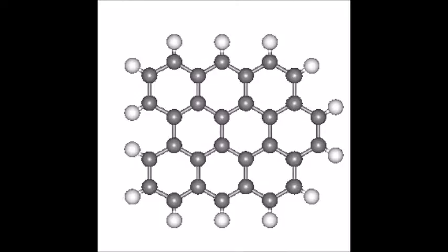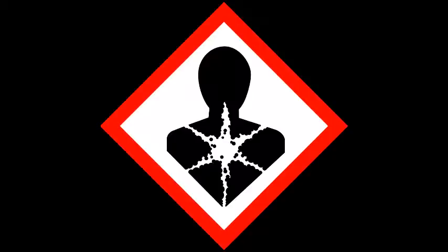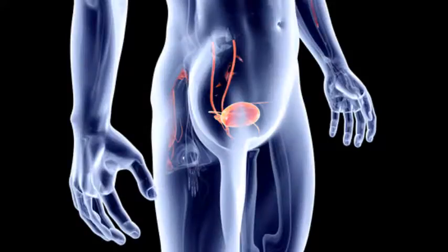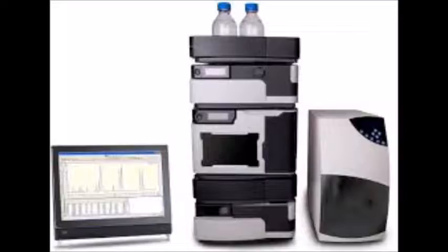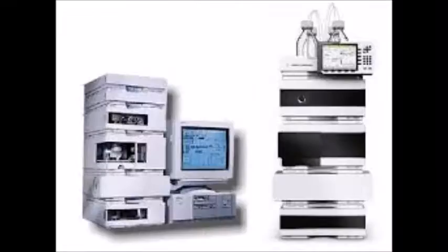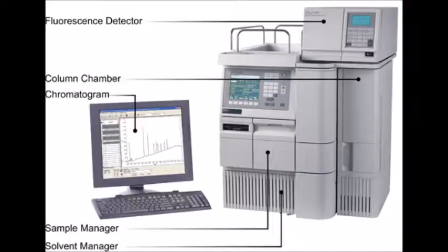They are neutral, non-polar molecules which have been identified as carcinogens in some, if not most, cases. Currently linked to skin, lung, bladder, liver, and stomach cancers, PAHs are a high-risk chemical that is important to monitor. HPLC is a fast and effective way to accurately analyze the levels of PAHs in liquids. As such, we have been using HPLC to monitor these pollutants in our environment.